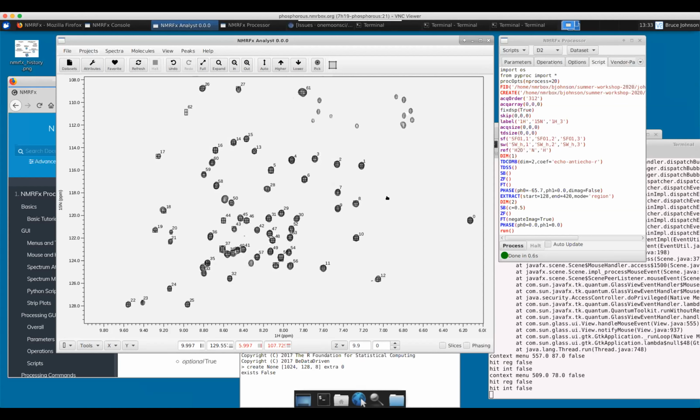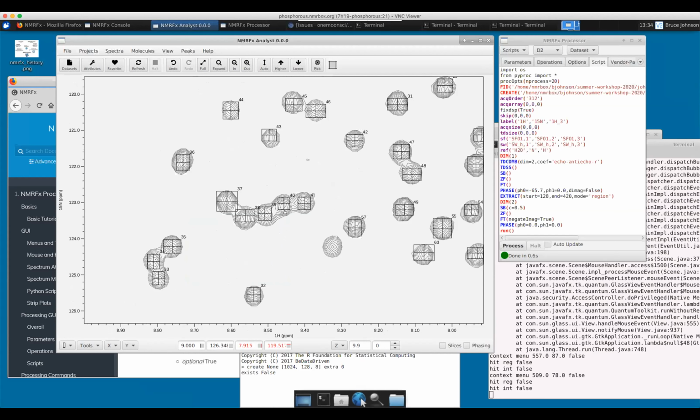So the line width and the peak position are constant across all the planes, and the intensity is allowed to vary. One thing that allows, especially in areas where the peaks are overlapping, is that it's simultaneously fitting peaks that are overlapping, so you get a better resolution. The fact that you're fitting across the whole titration curve allows it to more independently extract the position of those two peaks.